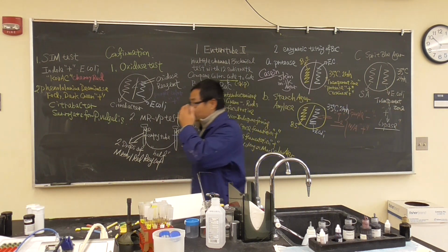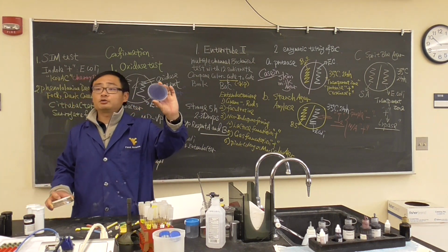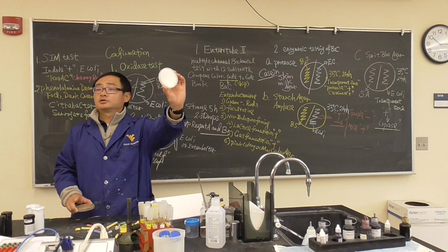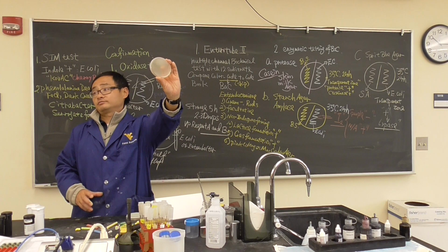Okay? Now, how do we recognize these agar? I'm going to give you some examples. What is this agar? Spirit blue agar. We already said blue, that's blue. What is this one? Skim milk agar. It looks like milk there. Then what is this? Starch agar.